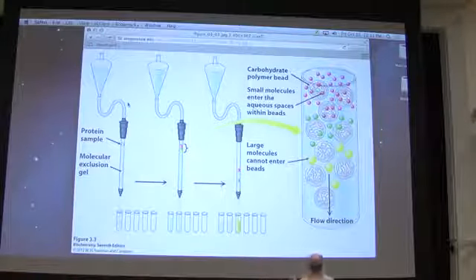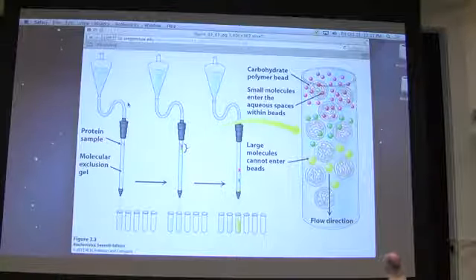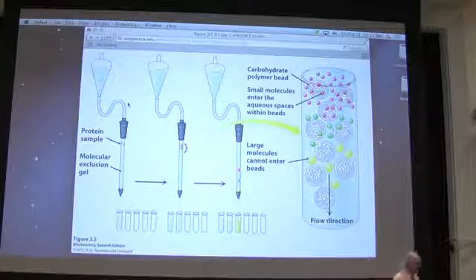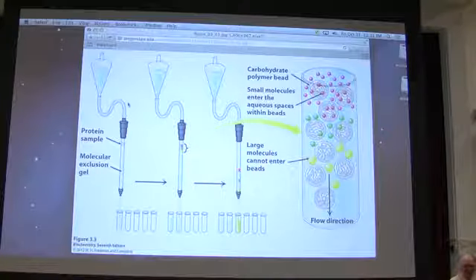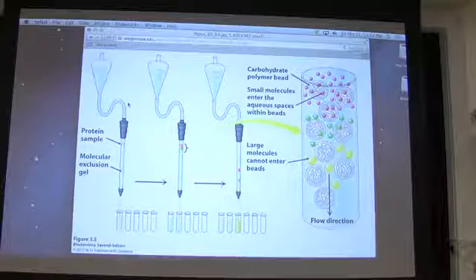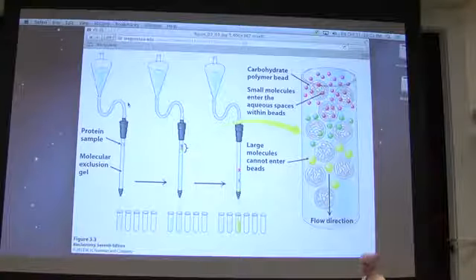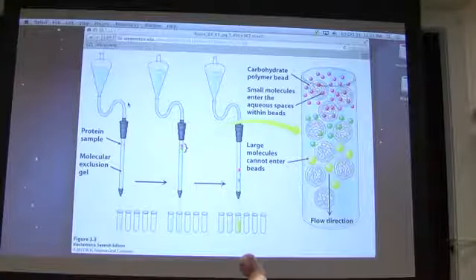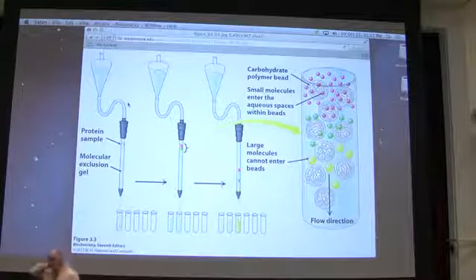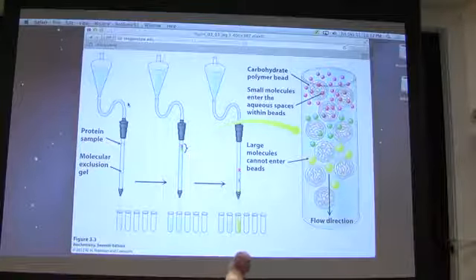But for the most part, we look at this thing right up here, we can see that the yellow guys, which are so big they don't fit in there, are zooming through. The green ones, which are close to the size of the beads, may fit in some cases, not fit in other cases, and they go in the middle. And then the little guys up here that are less than the size of the exclusion limit, they travel through all kinds of beads. They take a much longer path going through. Gel filtration chromatography allows us to separate proteins on the basis of size. We'll see other ways of separating proteins on the basis of size as well.